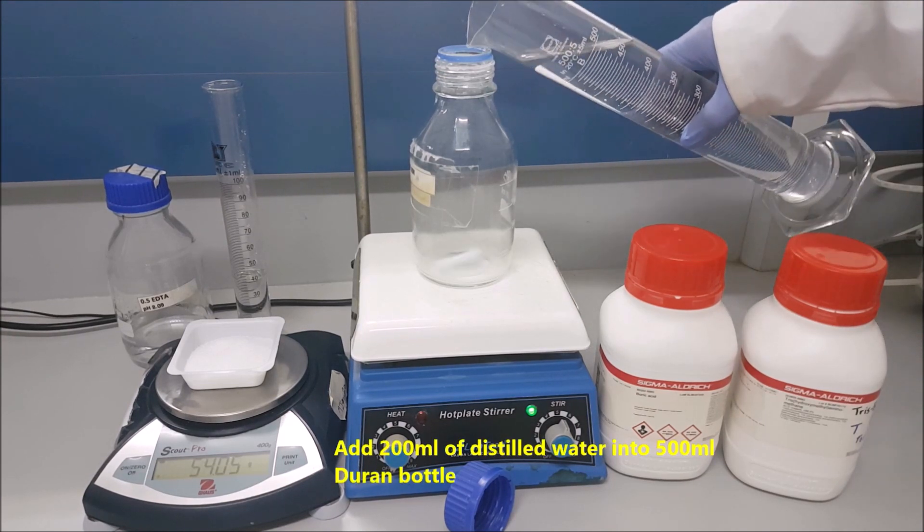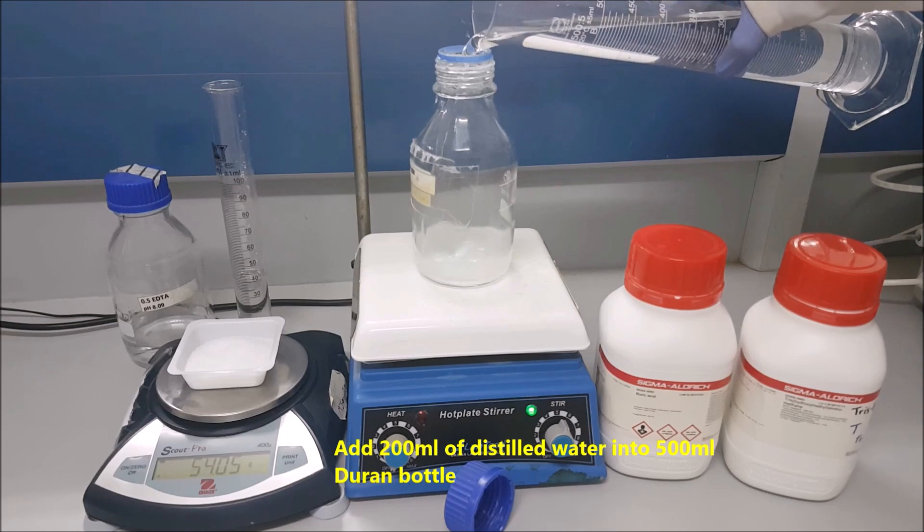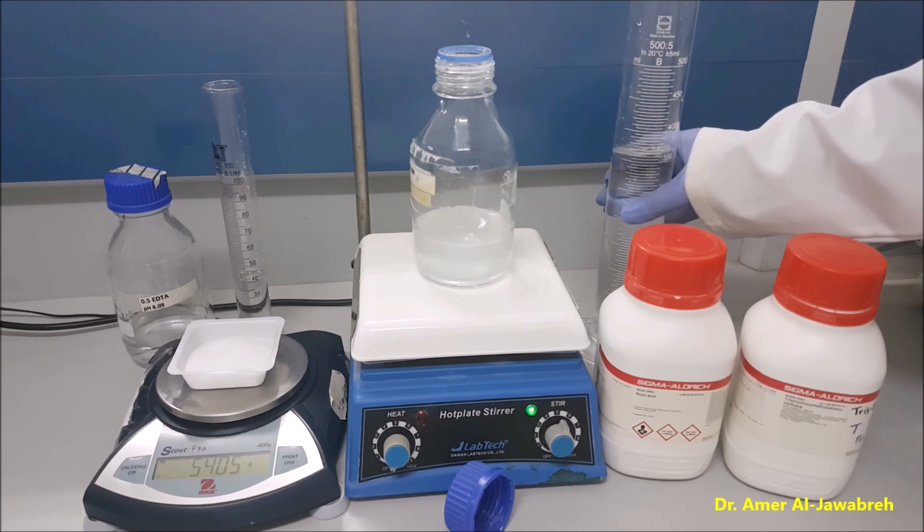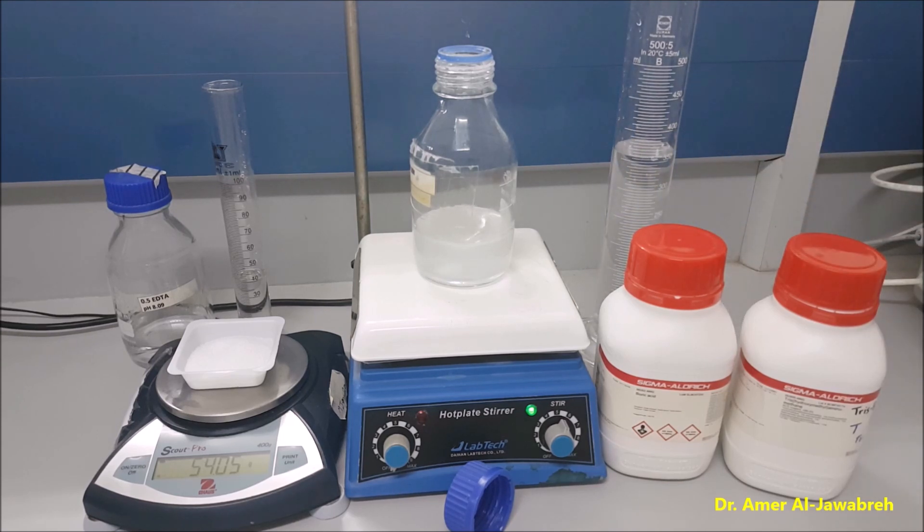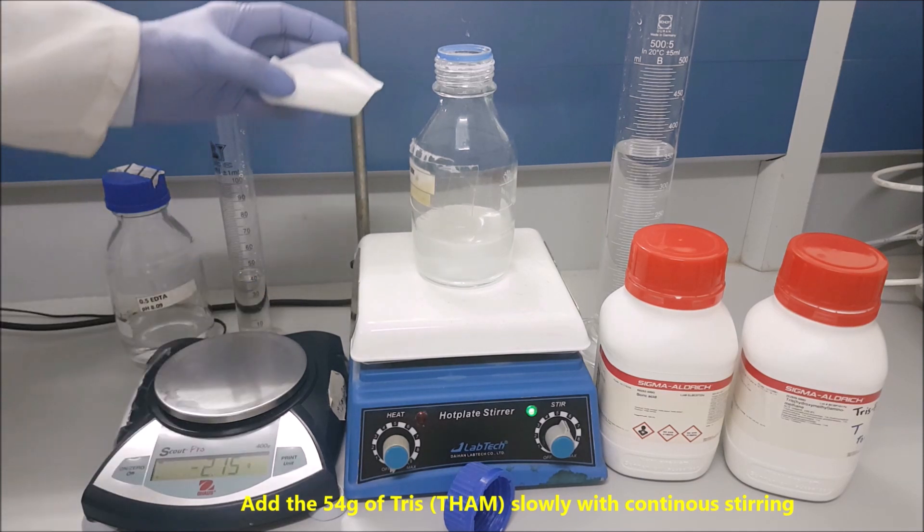Add 200 ml of distilled water into 500 ml Duran bottle. Add 54 grams of Tris slowly with continuous stirring.